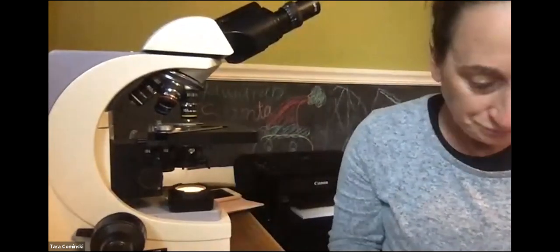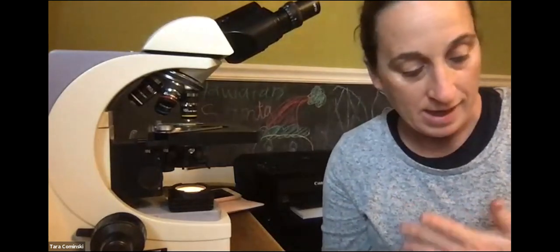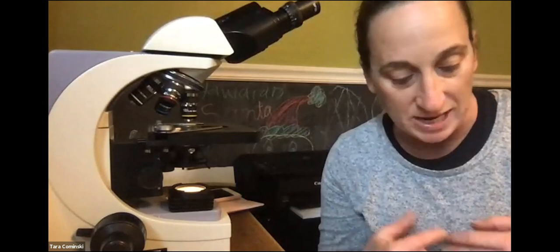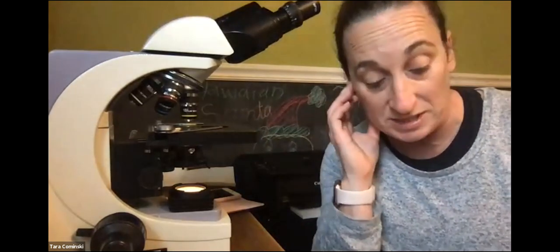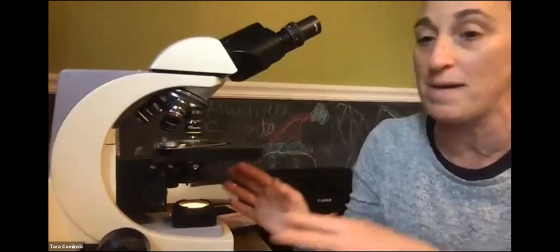Okay. Now, it mentions the difference between a dissecting microscope and a compound light microscope. Please make sure you read the differences. I'm going to expect that you know the information that's presented in terms of the difference between a dissecting and a compound light microscope. Also, what some of these terms mean, right? They're in bold. What compound means: two sets of lenses, okay? Meaning ocular lenses here, right, where we're looking through, and then these objective lenses, okay? So that's where we get the name compound light microscope.